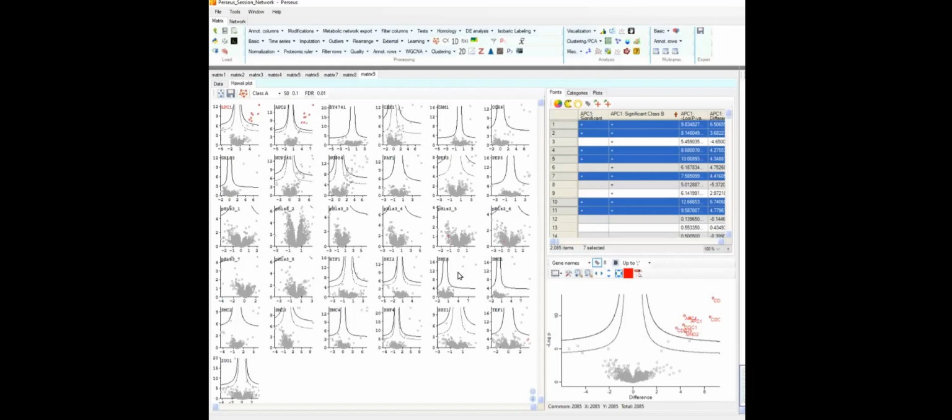But with this information now, we can create the base for a network. If you remember, we have the edge list, a first representation. Actually, now we are going to create a matrix. So we will have baits on one side, and then the prey on the other side of the matrix. How to do so? We just go into this part of the graph. We have create network from significant interactions. So only the significant interactions will be selected for our network, and that is what we want.